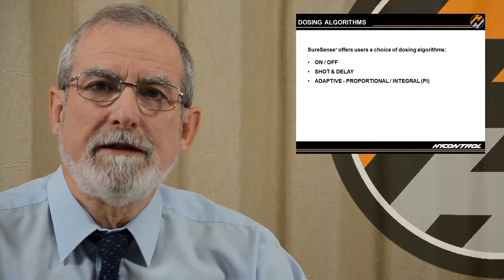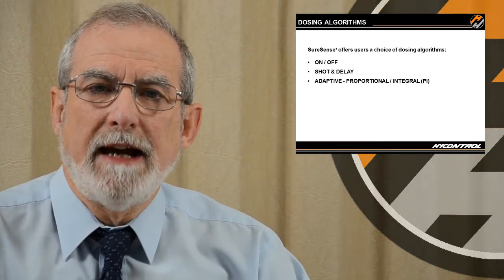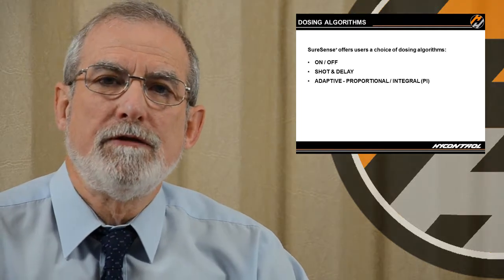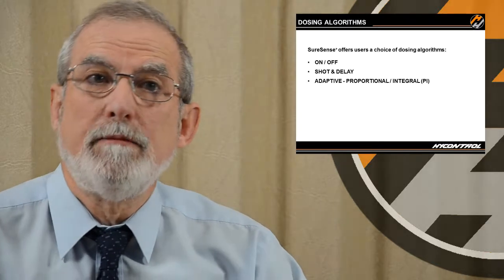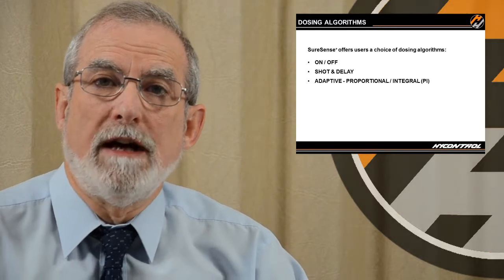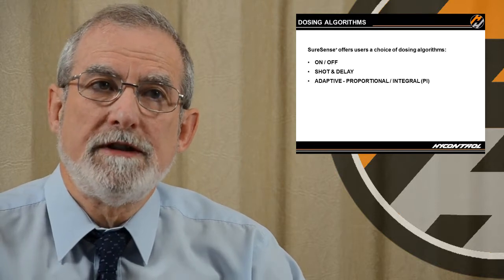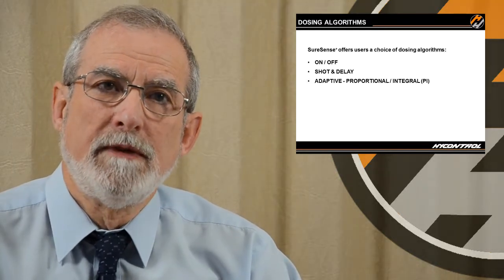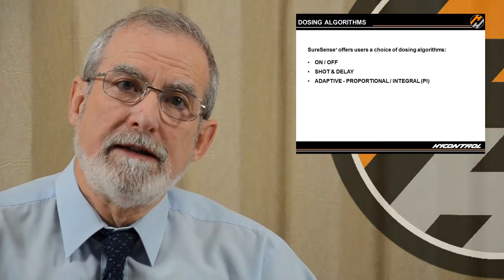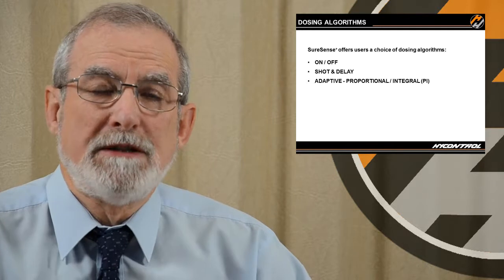So we want to create an effect in which the integral term is just balancing out the effect of new foam by adding small amounts of antifoam just to stop the foam raising any higher, but we don't want it necessarily going any lower either. And if we do that and manage the foam at a fixed level, that actually reduces the antifoam addition to the very minimum. It's better than putting more antifoam in and dropping the foam down completely. It actually results in less antifoam addition, which means saved cost, which means better control.